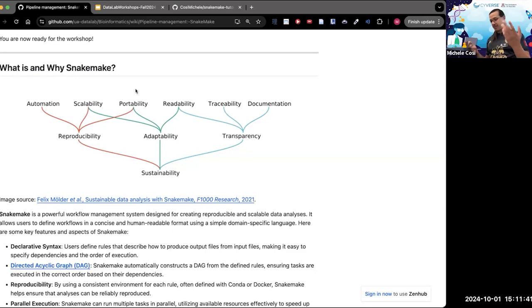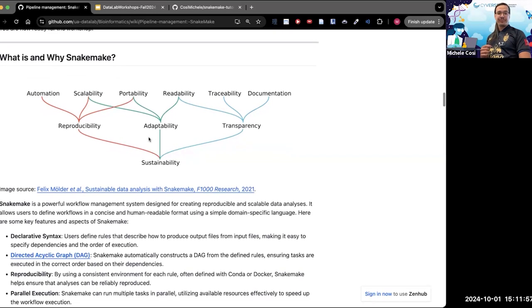Another great thing about Snakemake is that it does try to do a lot of things similar to Python itself. So if you are okay with Python, then you should be okay with Snakemake itself. Before I do continue, I see a lot of people here are R enthusiasts.